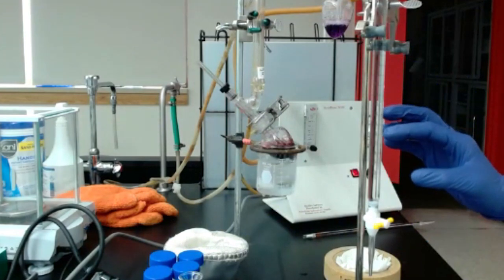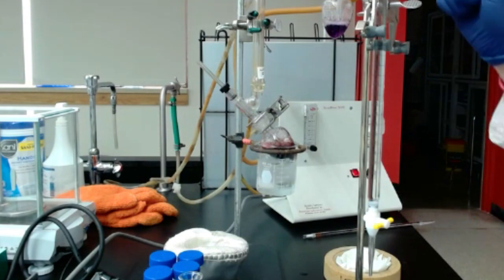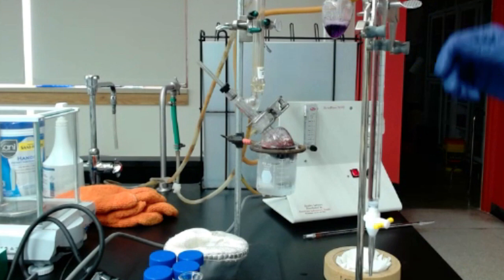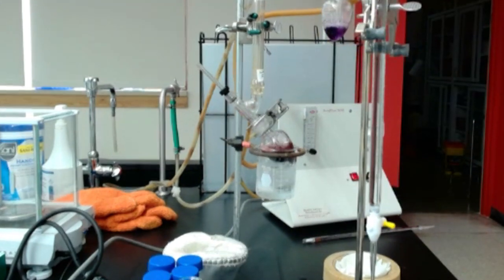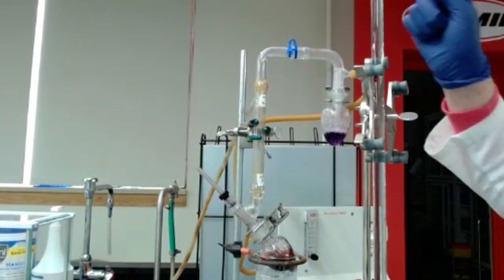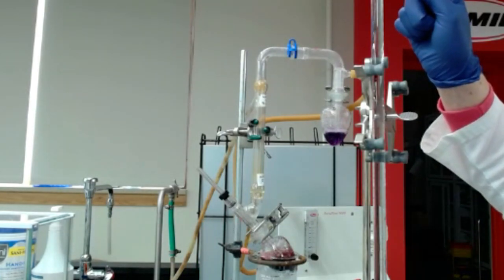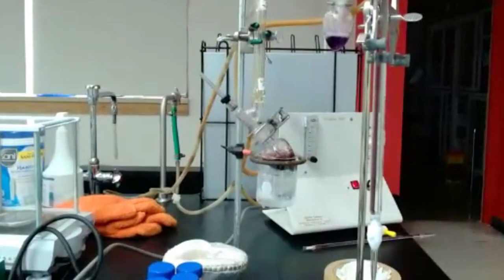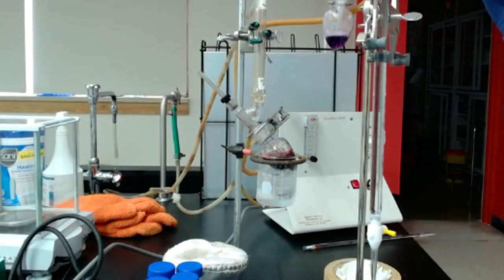So you have sodium hydroxide. Now, the first thing you need to do before starting any titration is looking at the initial volume of your sodium hydroxide solution. That's where you need to come on top, so your eyes should be right in front of the bottom of the meniscus. So I have 17.7. All right. Sorry, it's moving. So you record that initial volume, 17.7.